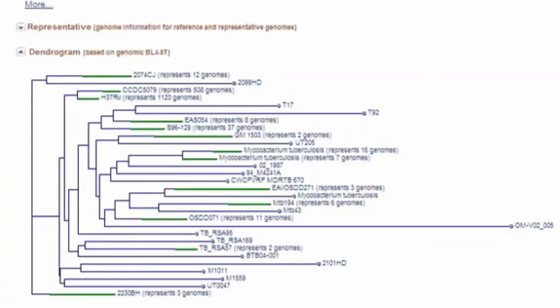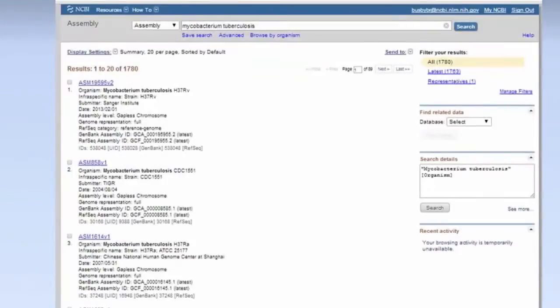Our intention over the next 9 months to a year is to make this tree totally interactive, going down to the individual strain level from which you will be able to link to Assembly. But we have not enabled that functionality yet. Please be on the lookout for a webinar where we will actually solicit user input on how that resource should be laid out. Right now, like I said, I think the best place to get sequences for individual strains is from the Assembly database.